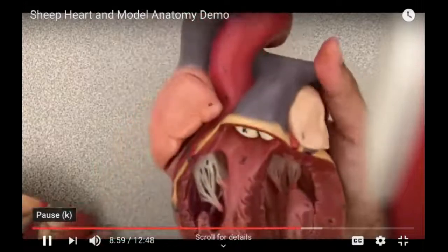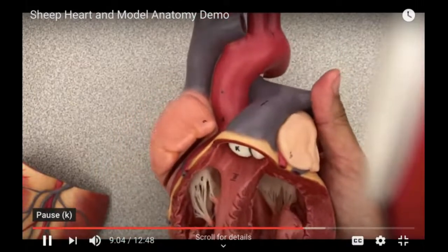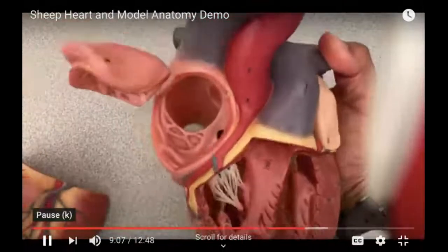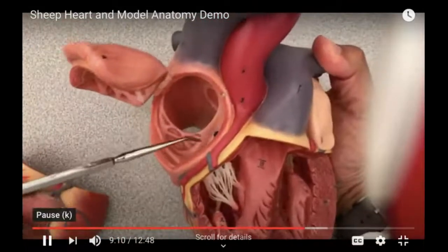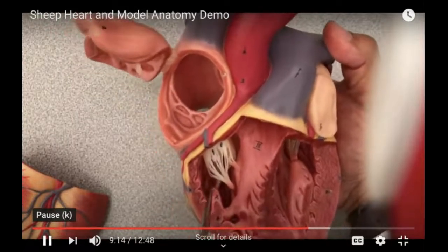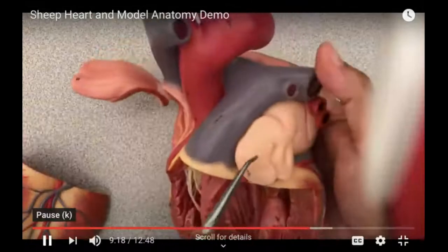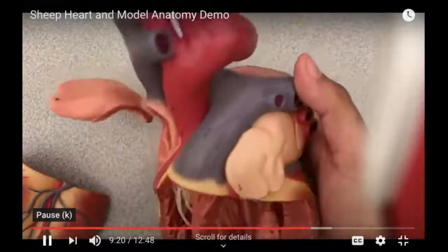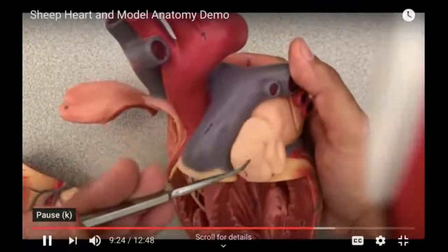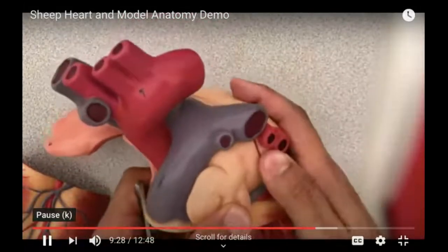Open this up, and now we see the four chambers. This here would be the right atrium, and then below the valve here, this would all be the right ventricle. And up here, underneath the left auricle, would be the left atrium.